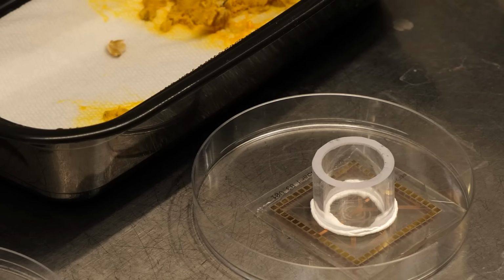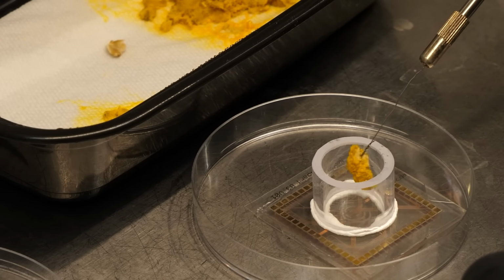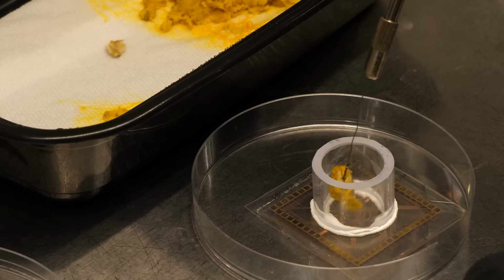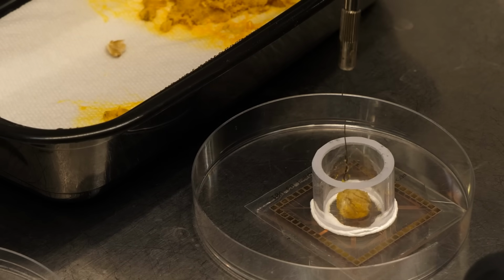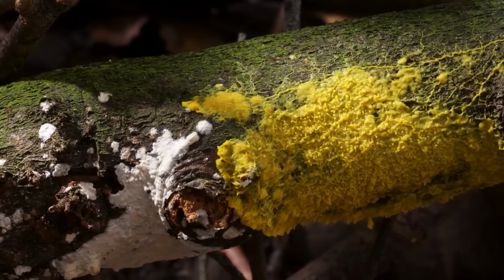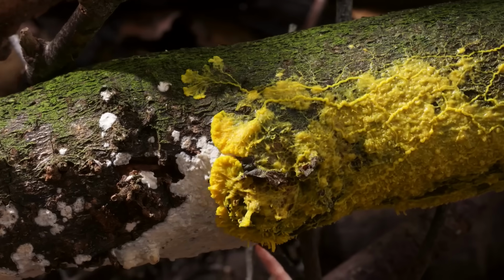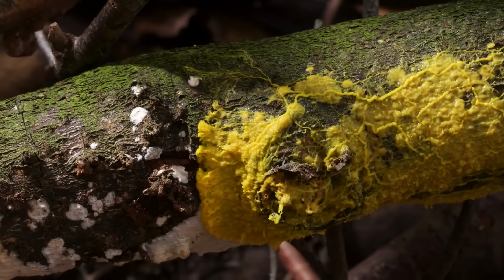One nice part of working with Jerry is that I can just take a blob of oats and Jerry and slap it onto the arrays, rather than having to carefully tend and grow the neurons like usual. And insofar as Jerry is used to growing on the forest floor, Jerry doesn't mind a little bacteria, so for short experiments, we don't even need to worry about intense sterile technique as much.